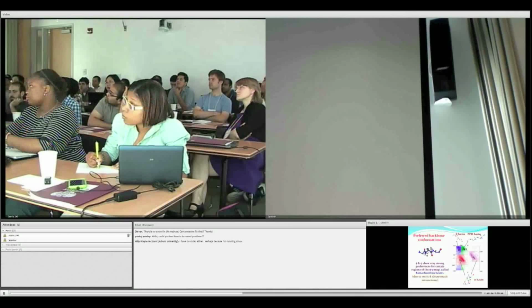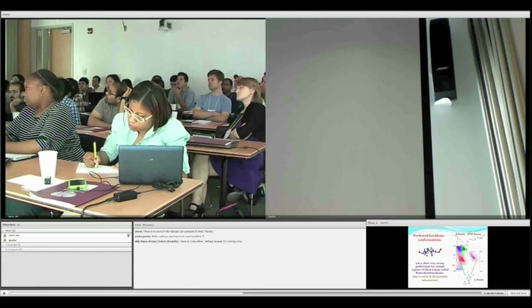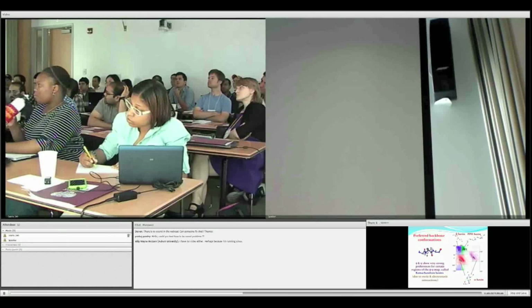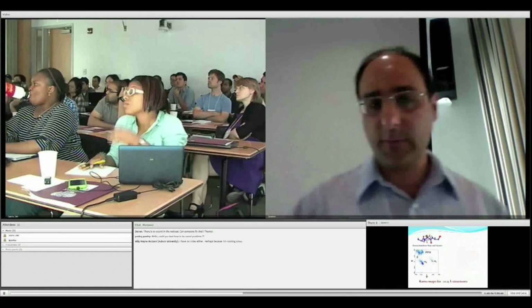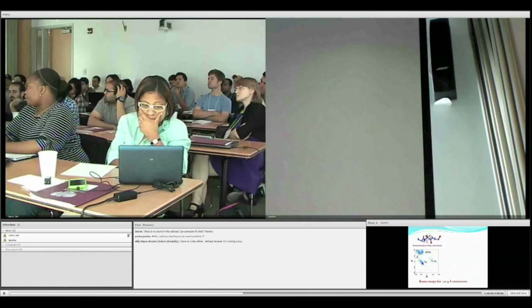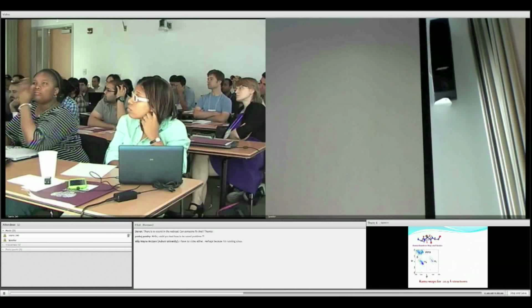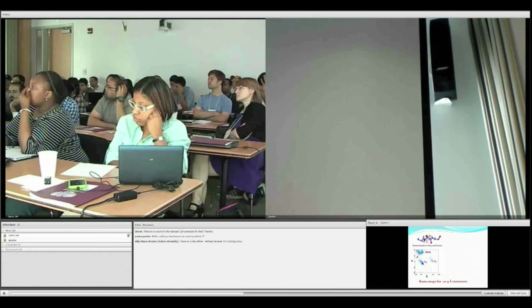So just a quick overview of the Ramachandran map. You know that we have two angles, the psi, which is the C alpha C plane angle, and the phi, which is the N C alpha angle. And it has been known for 40, 50 years that there is a preference for these regions of phi and psi.